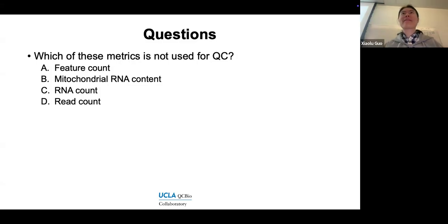To correct for PCR amplification. If you see two copies of the same UMI, then you know that it was from PCR. Yes, and then those two would be counted twice in the read count. So the answer is UMI is introduced so that we can remove the PCR amplification bias, where we may see two or more replicates of one mRNA molecule.